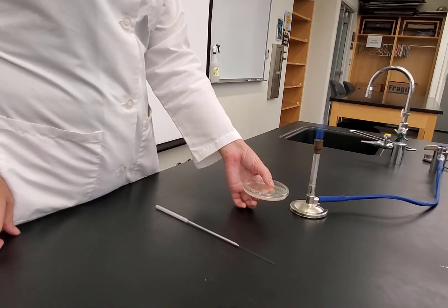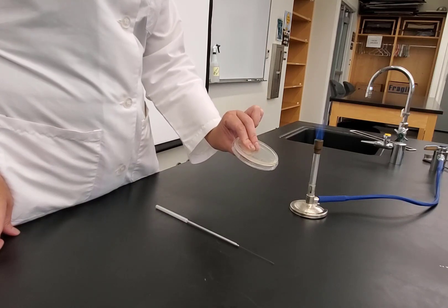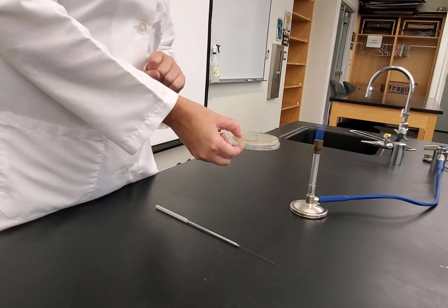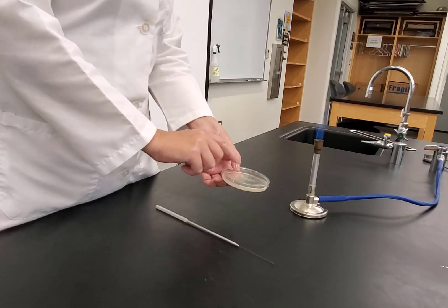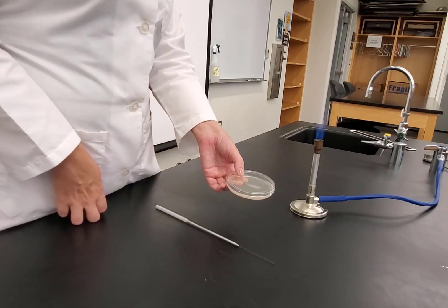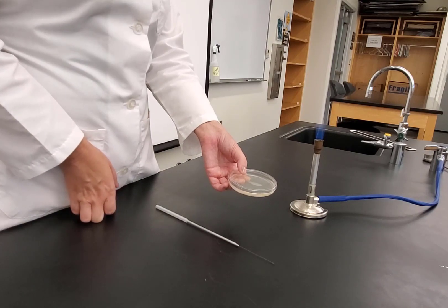I would take my starch plate, turn it agar side up, and place it in the incubator and let it grow for 48 hours. After the time period, I would flip it back and have growth on my plate. I would then add my iodine test for starch, and we'll talk about what the readout should look like.